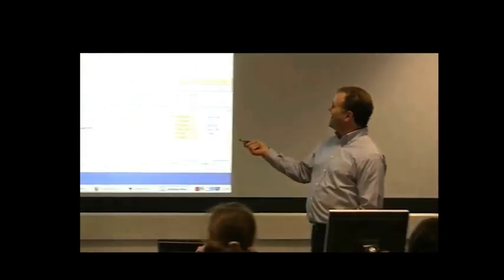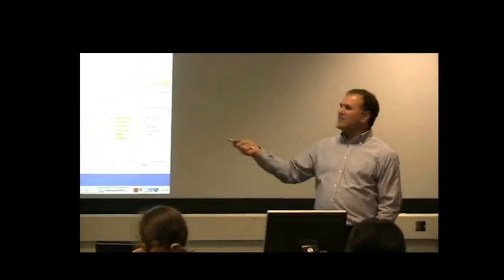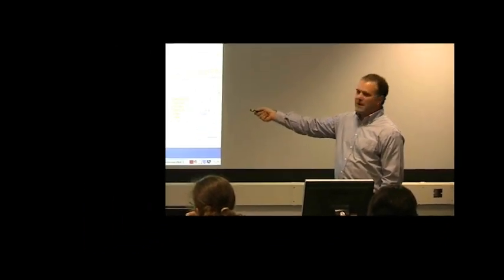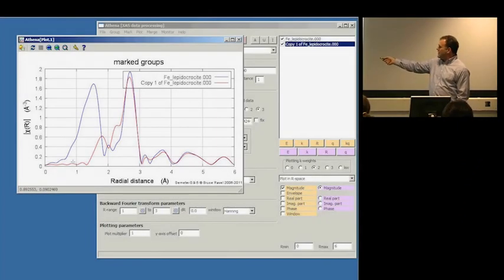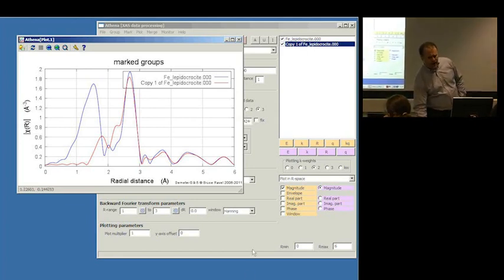That's the thing. You run a risk of damaging the data. That is, to the extent that you believe that this peak is part of your data, the choice for the red line is obviously problematic because you've cut all of those Fourier components out of the data. So again, it's useful to go back and look at the data in energy.